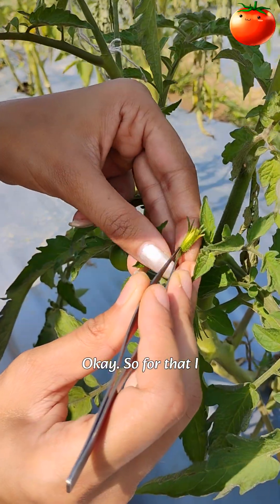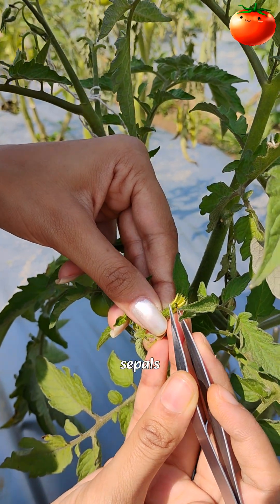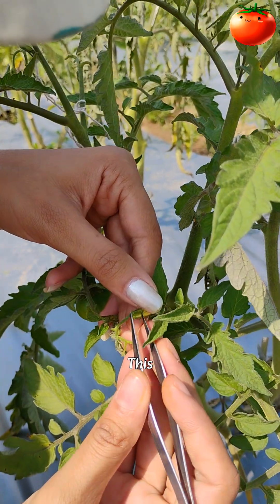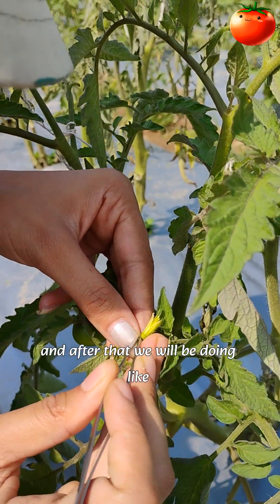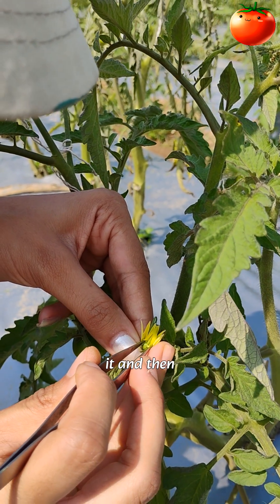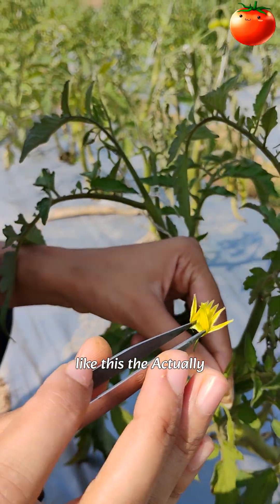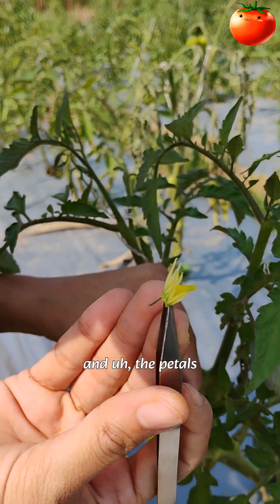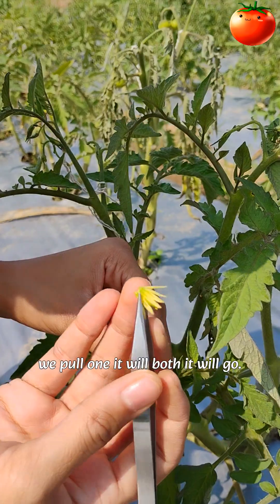Now we will be emasculating this one. For that, I will take these two sepals and then pull it like this. We got this, and after that we spread it — it will come off easily like this. In tomato, the anther and the petals are attached, so if we pull one, both will go.